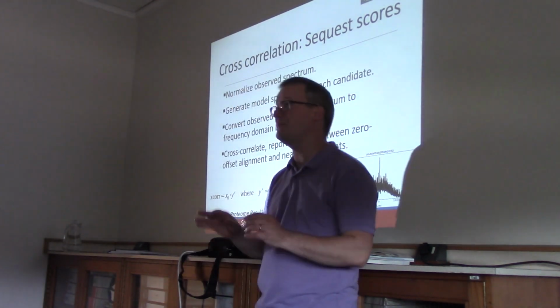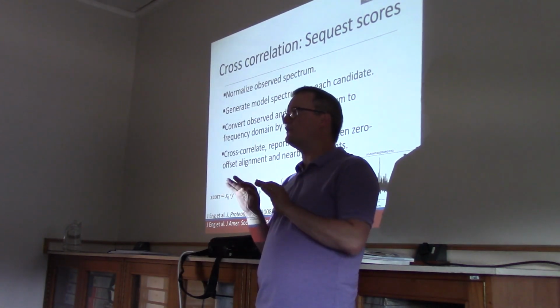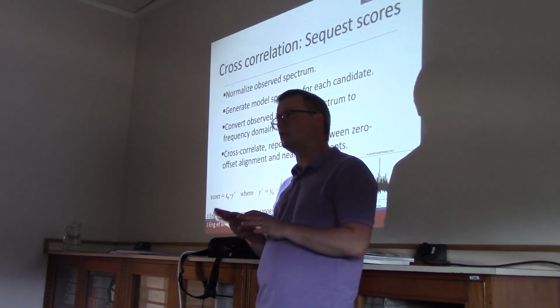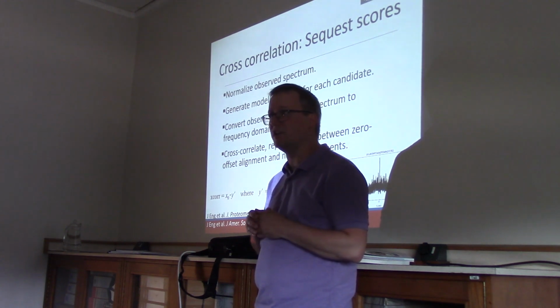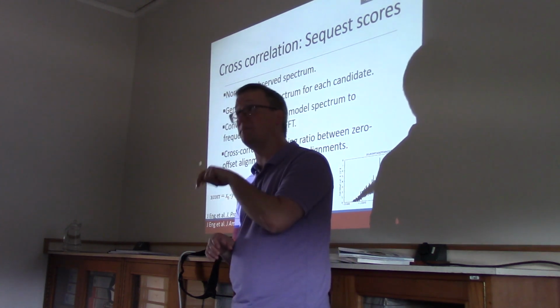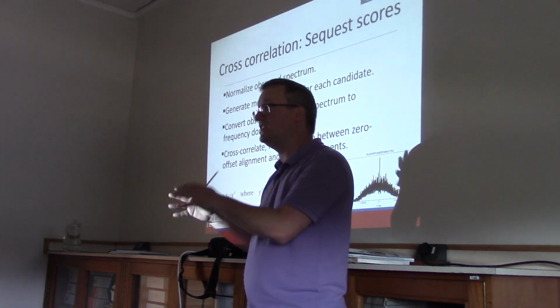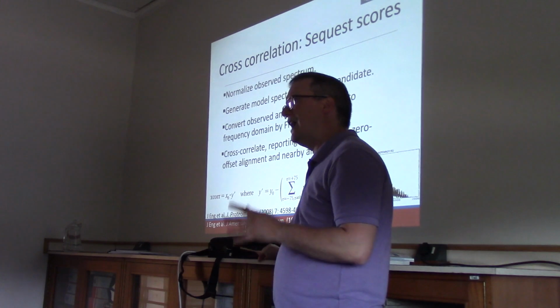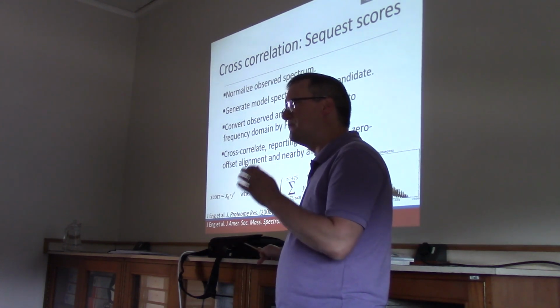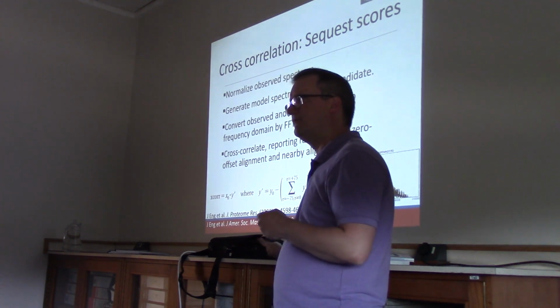Great, so we've talked about how to digest a protein in silico. We've talked about the impact of post-translational modifications on how many candidate sequences must be compared to each spectrum. And we talked about the peptide mass filter, which is the feature that allows us to decide which peptide sequences get compared to each spectrum. But we haven't really talked about how to compare an observed tandem mass spectrum to our model of it.